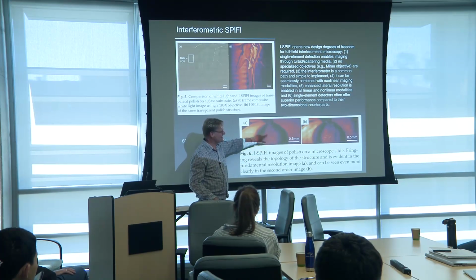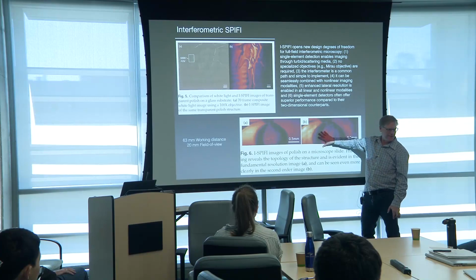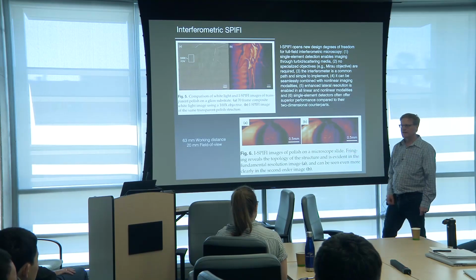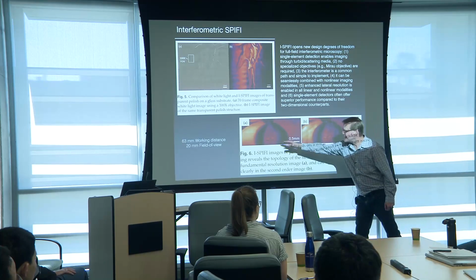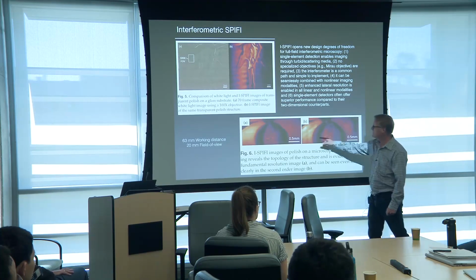But what's cool is, this is the first order image, and here's the second order image. You can see it even on my computer. Now the pixel density is doubled, and I can follow the fringe into Z much better in that second order image. The fringe spacing is still the same between them. But it really allows me to measure that topology much deeper than what I thought. This one I love.